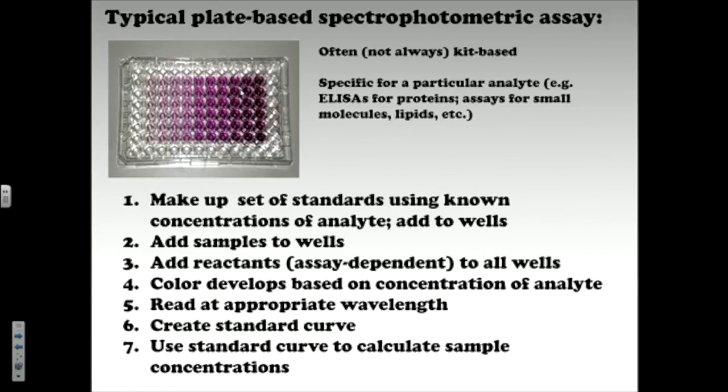And there's a couple of them on here that are going to demonstrate to you some potentially confounding factors when you're doing a plate-based assay, some things that'll sometimes throw you off, that might make things a little bit difficult for you. So you should see those as you're working. I have 3 of them, you might have to share.